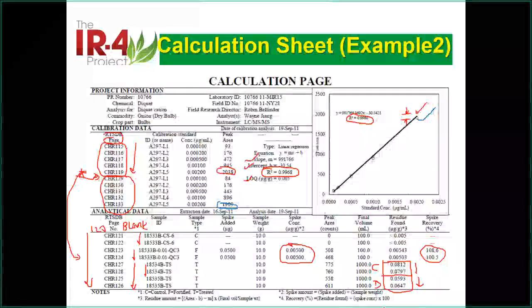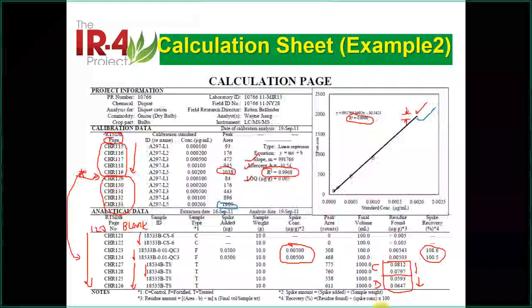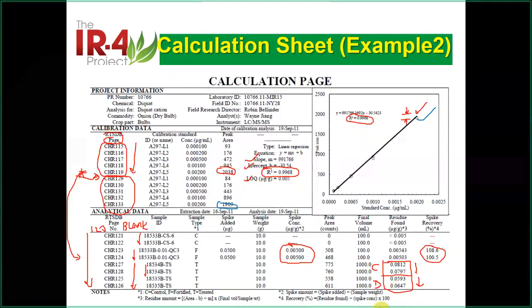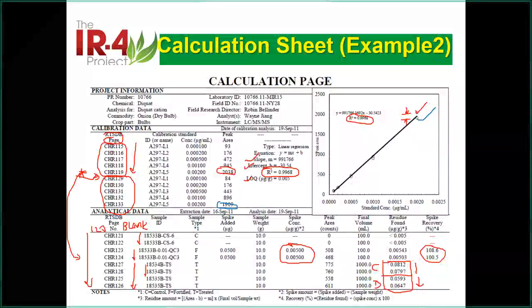So we do know in the IR4 system, C and D should be the same sample, but they put them in different bags, different samples. It's just like a sample in the field, like a triplicate, but in the lab we treat them totally separately. It's okay. So in this case, there's a good indication the analysis is good because the difference is very small.